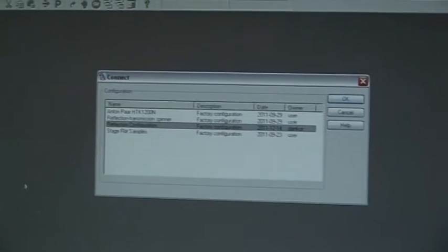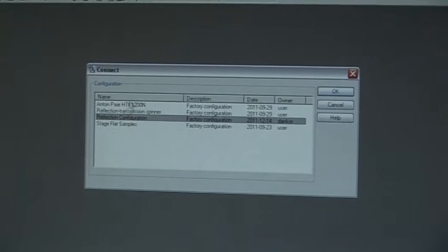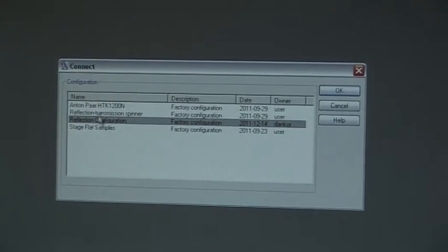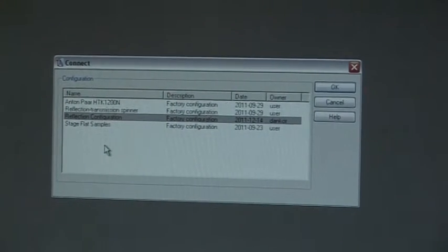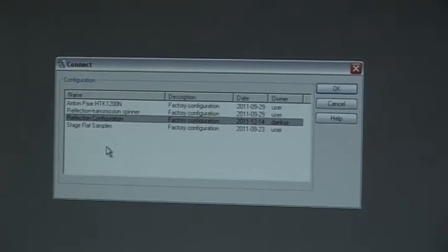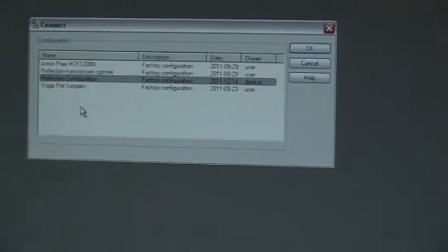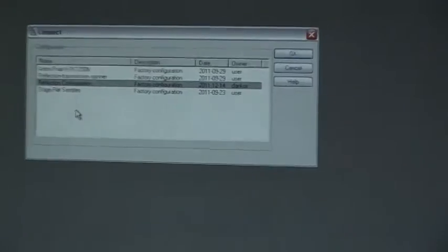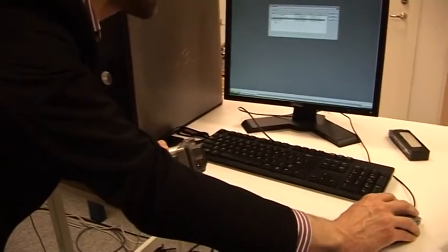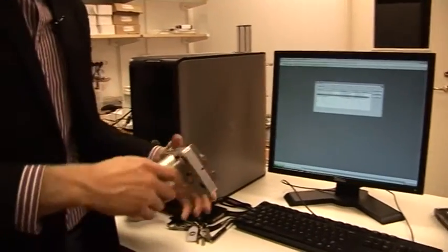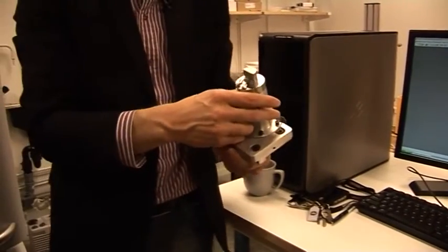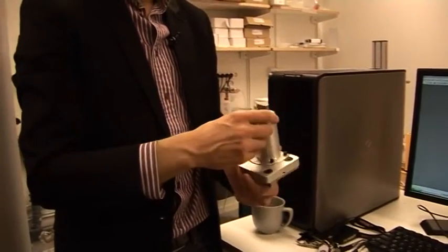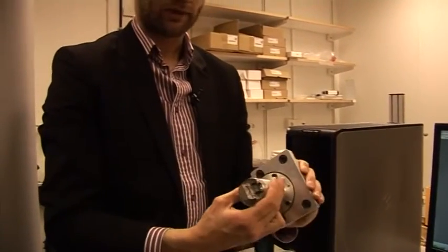The first thing we should do is to connect the instrument to the computer. When we press that we usually get some sort of choices, and the choices are different sample stages that we can use. For instance here, this last one, stage flat samples, looks like this. It's the most simple sample stage you can get in this machine and it's only used for flat samples.